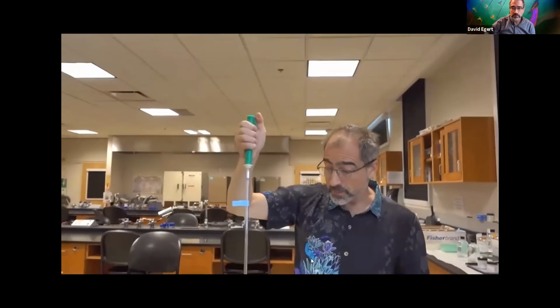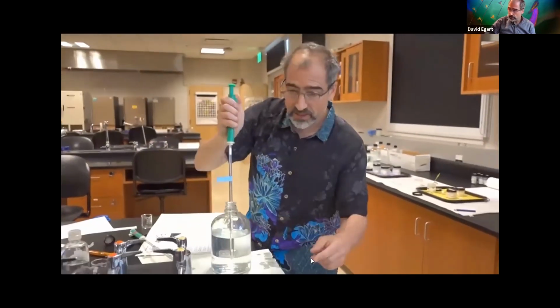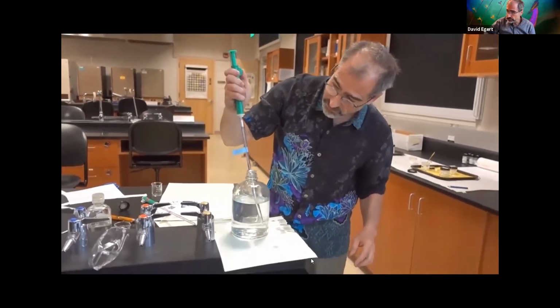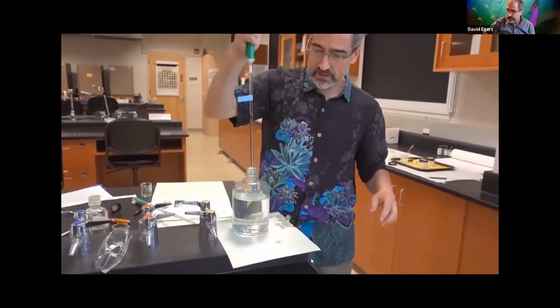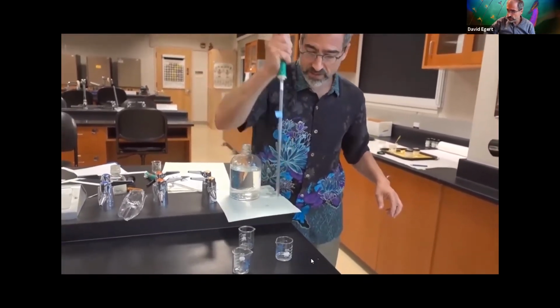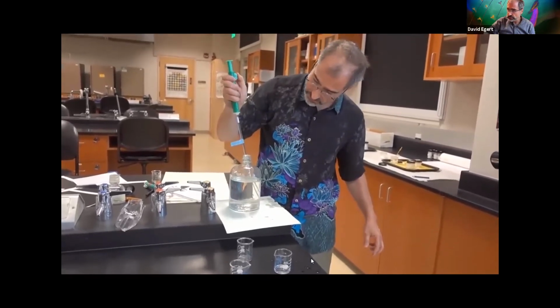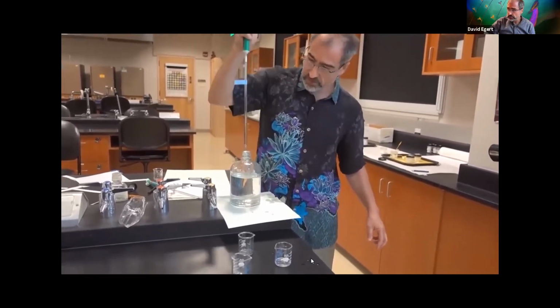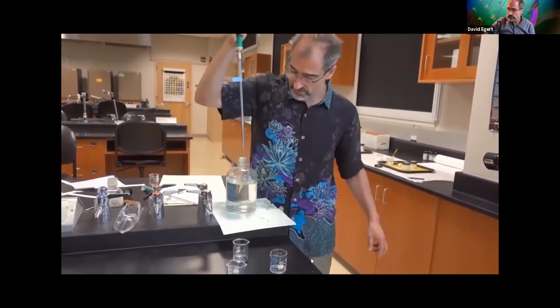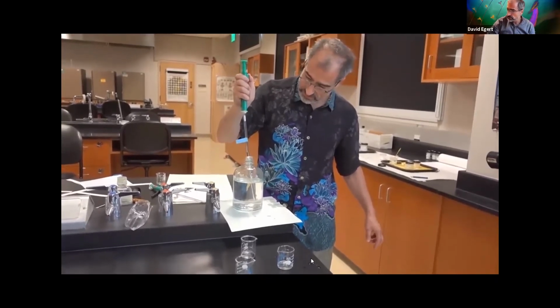Because I need 5 mils inside each of these, I can just pull up to the 0. I'm going to quickly, there's 5 mils there. Suck up again, up to the 0. 5 mils there. Zero.